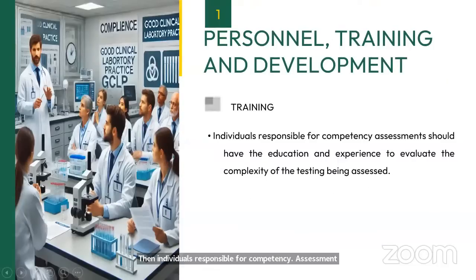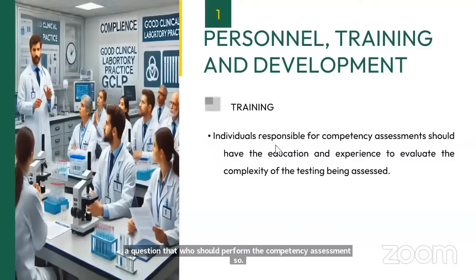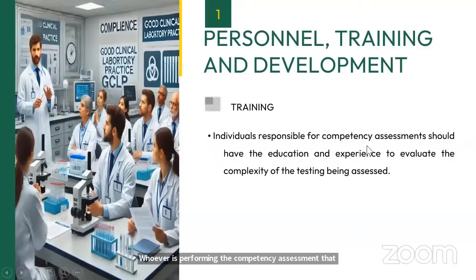Now, who should perform the competency assessment? There is always a question about who should perform it. Whoever is performing the competency assessment must have appropriate education and experience. Suppose I am a microbiologist, and I am going to perform the competency assessment of a person who is working in the histopathology area, and I myself am not aware of those activities. Then I cannot perform that competency assessment.